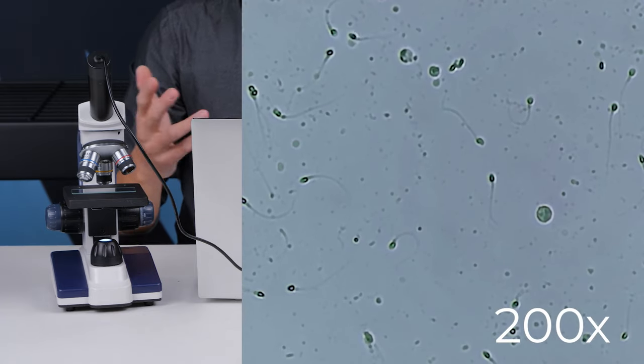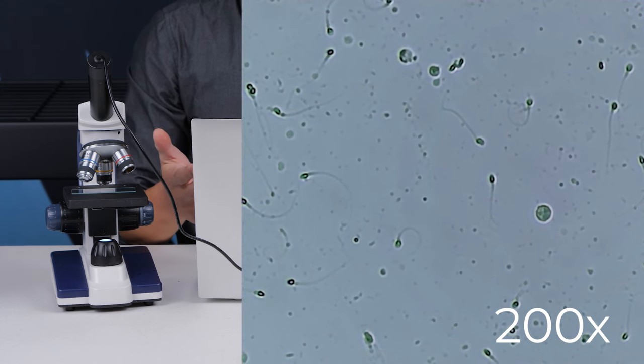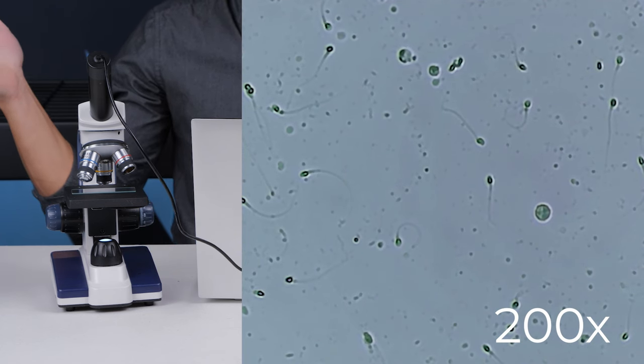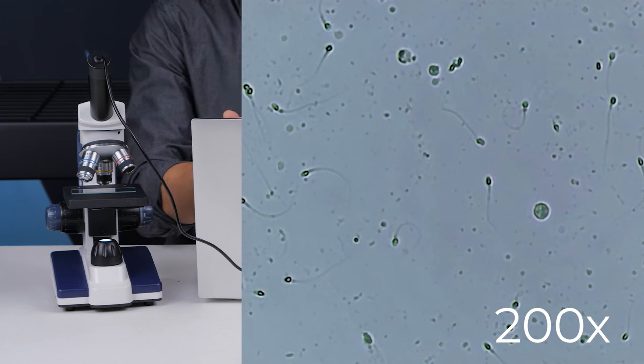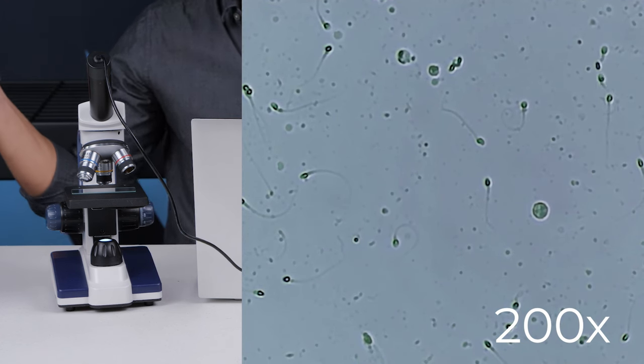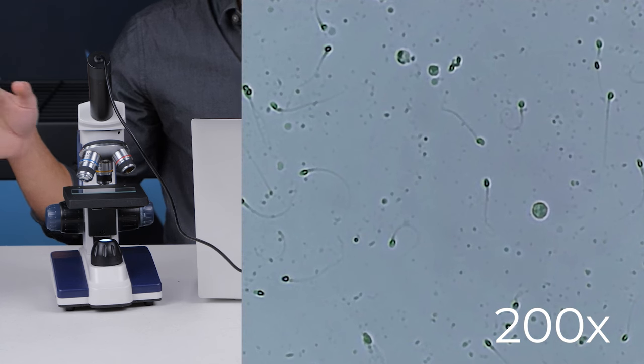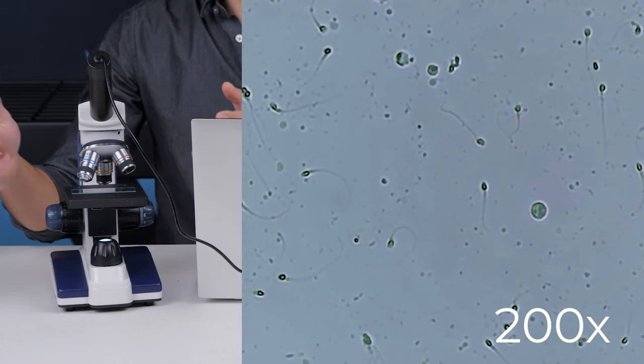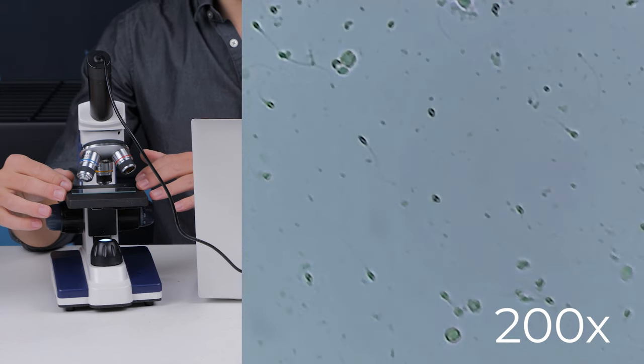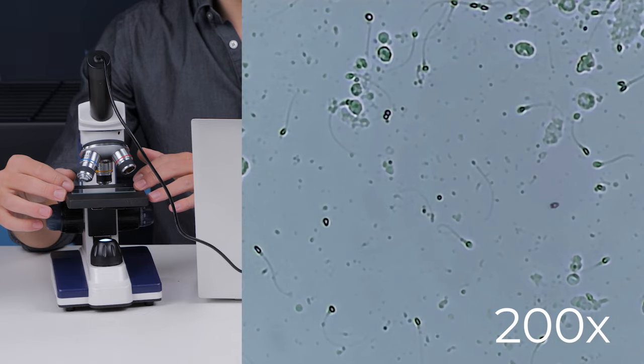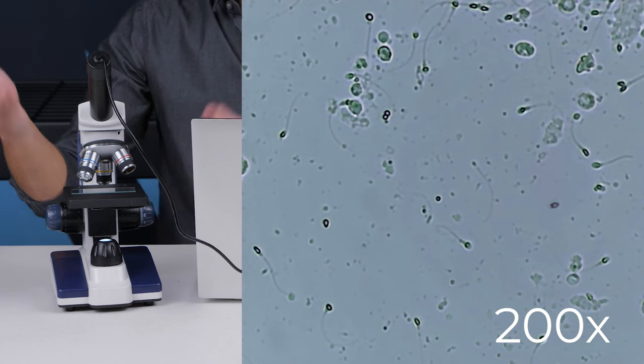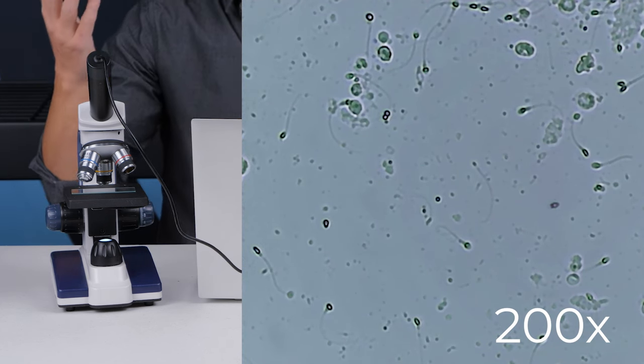And you'll notice as you watch this video of mine, there are a bunch of sperm all over, but most of them are not really moving around. I think it's because I'm in a relatively cold little office warehouse right now, and so these sperm aren't really moving around. I mean, this guy clearly has, he's got the zoomies, but the rest of them. It could have also been that I did end up doing quite a lot of swirling the sample around when I took multiple shots on the camera and whatnot. But there are a lot of different variables that will contribute to how much the sperm end up moving around, and I've certainly seen at least quite a bit of variability. But like, it's pretty easy to see sperm, right? I mean, they're all over the place. I just put this in a random spot, and there are sperm everywhere in the field of view. And I mean, that's pretty much it. It's not that hard.